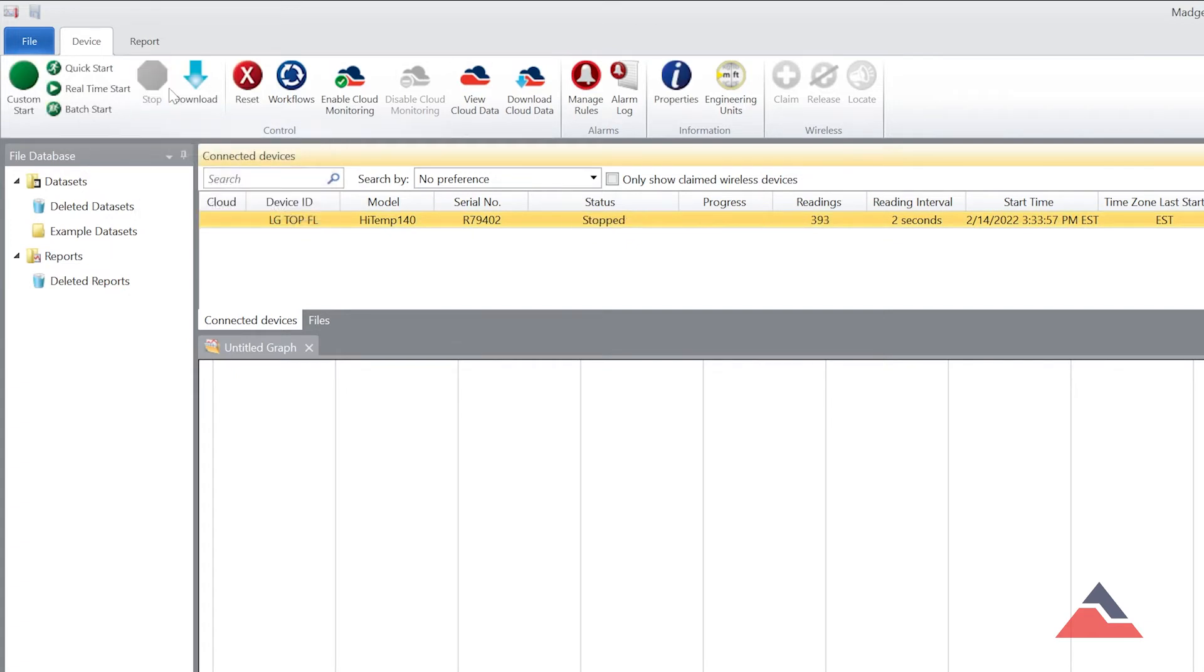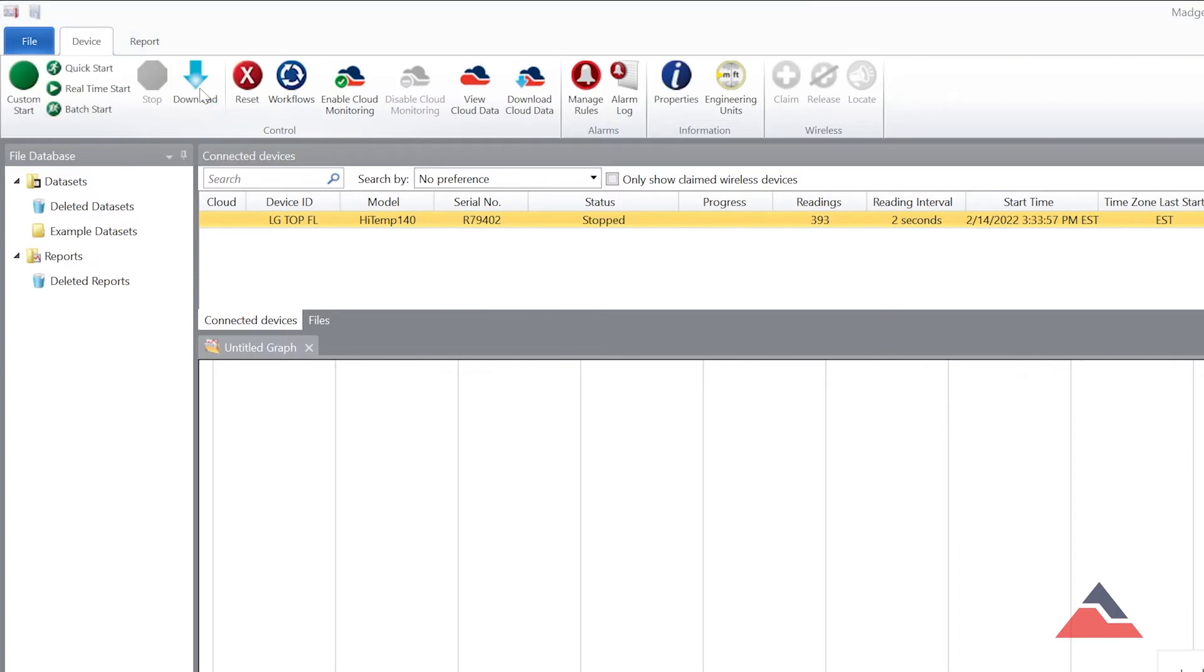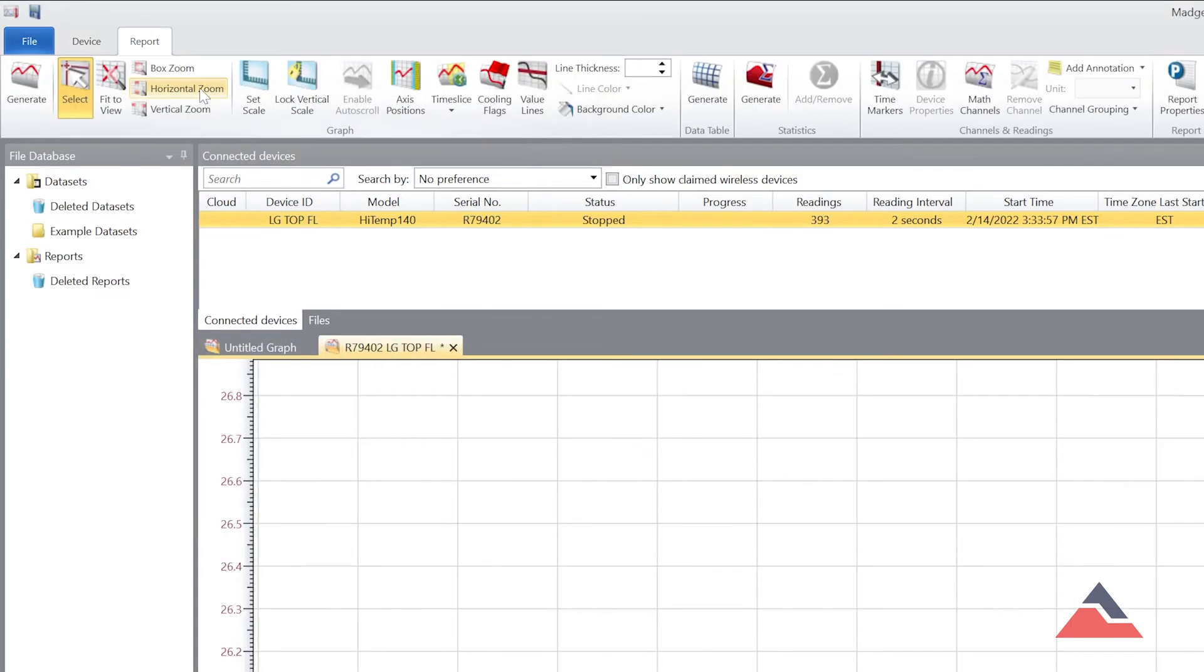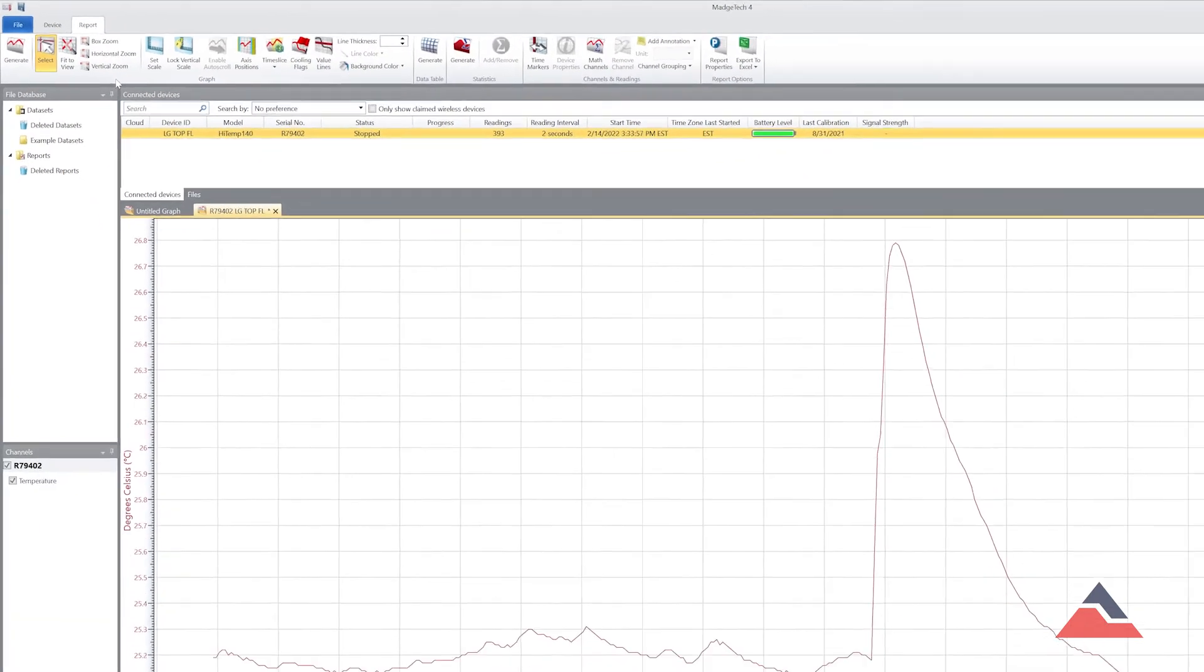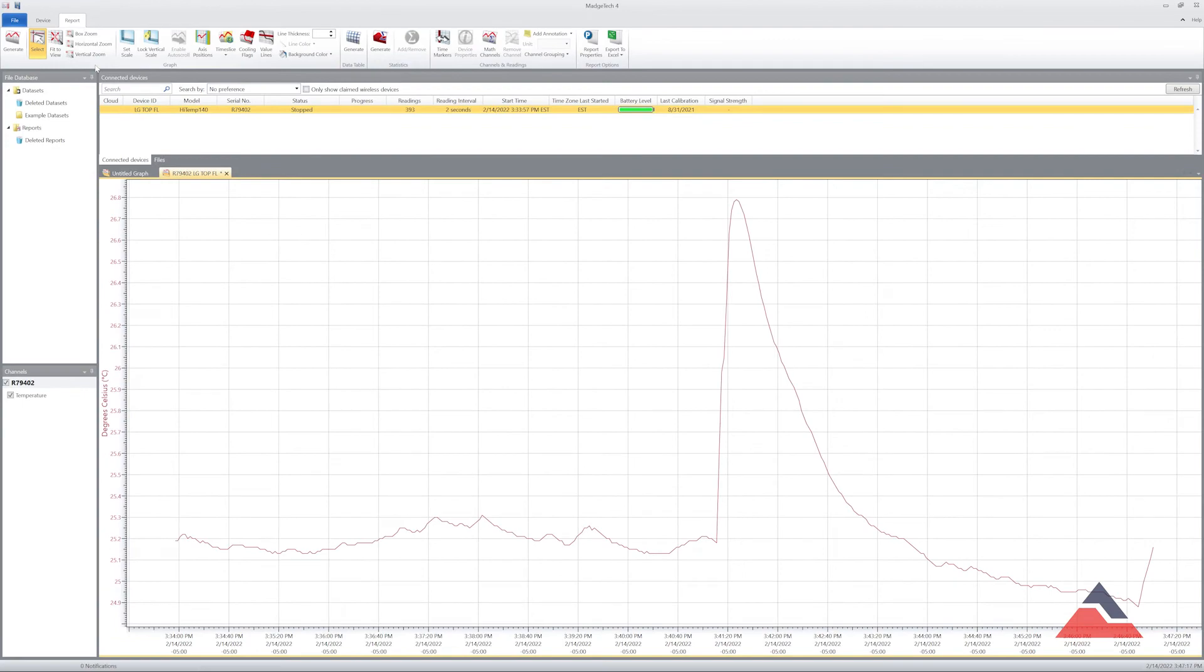Once your logger has stopped recording, hit the Download button and the software will now offload the data from your logger to your PC. Once the data has been downloaded, a graph report will automatically be generated.